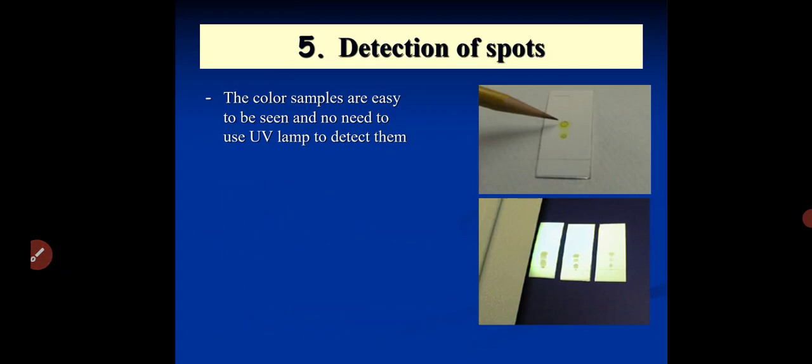Detection of spots. The colored samples are easy to be seen and no need UV lamp to detect that. This is the colored sample. Easily calculate the RF value. RF is the distance traveled by solute and distance traveled by solvent ratio, which is always less than 1. You see that this type of spots. This has 2 spots, this has 3 spots. So we easily separate out also.